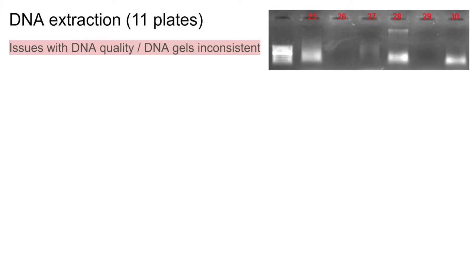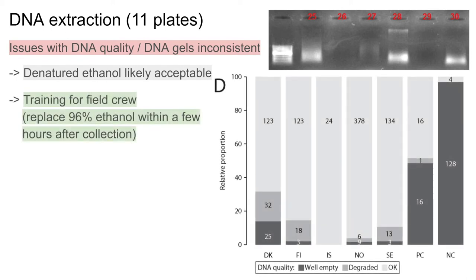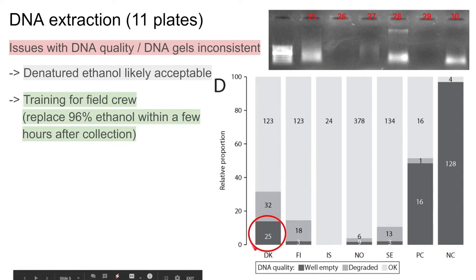The first issue we encountered was with DNA quality. A few samples did not show any DNA in the gel or did show degraded DNA. This is likely not caused by the denatured ethanol, as most samples worked just fine — we assume this problem is in sample handling. The instructions were to replace the ethanol with fresh ethanol a few hours after collecting the samples to ensure that the overall ethanol percentage is higher than 90%. We can see that, for example, for Denmark, there were a bit more samples affected with no DNA visible in the gels or degraded DNA.